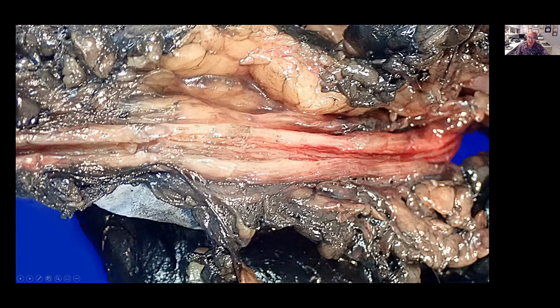I've seen probably 3 or 4 cases already of kidneys that are completely normal. And the description is very good about the normal kidney, and they took representative samples, there is no tumor, etc. And then next case. And then I see that the specimen had a 10 centimeter or a 20 centimeter ureter. And then the question comes about, and that's why it's so important to know the clinical history: why did they remove that kidney?